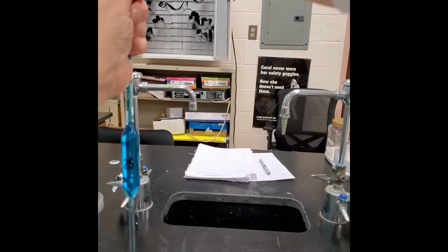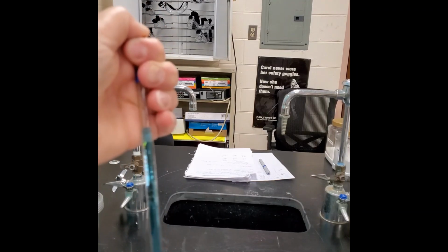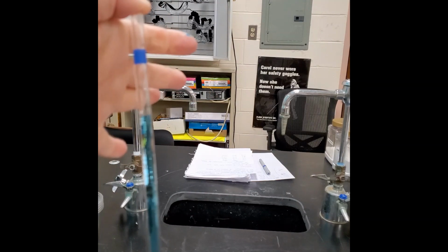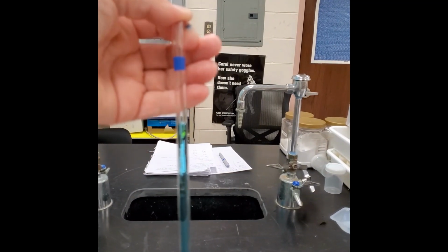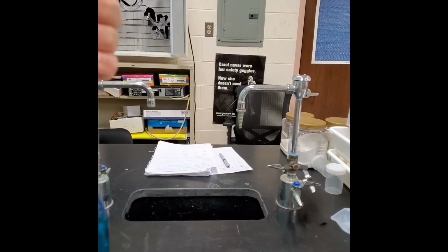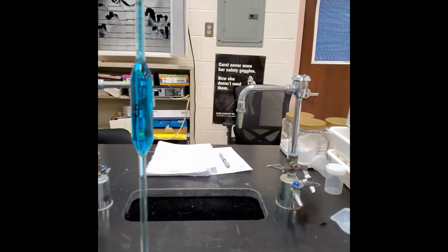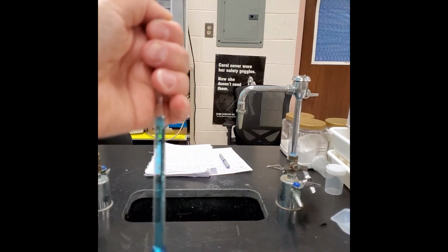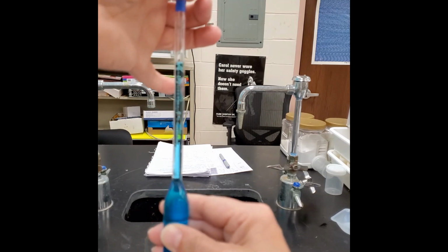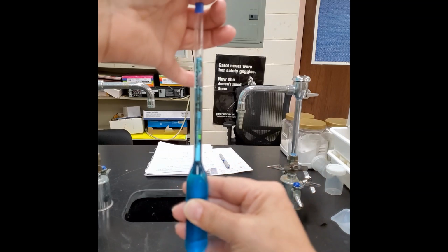You then are going to very quickly pull the filler off and put your thumb on it and pull it out of the liquid. So you see how my thumb is on there? Then what you're going to do is hold it over your source, hold it over your sample. And this takes a little bit of practice. I'm trying to hold it so that we can focus and see the line. It's kind of hard to get the focus.